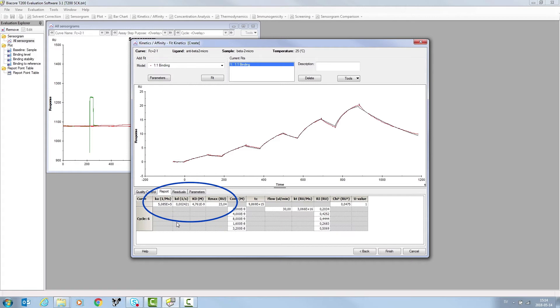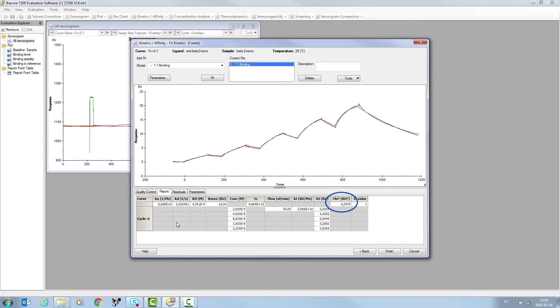Alongside the rmax and chi-squared. When determining the quality of the model fit, chi-squared should be less than 10% of the reported rmax. In this case, we report an affinity of 4.7 nanomolar.